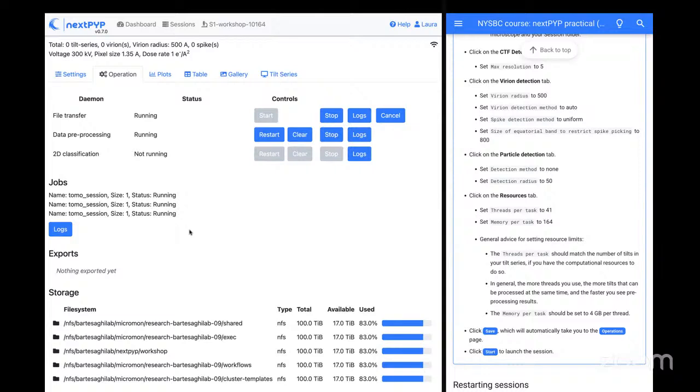So it might be how you're configuring it. Maybe your fiber card is not going at the speed you think it is. We've had issues: technically it should be 10 plus gig out, but sometimes it's a problem at 1 gig. Configuring. But if you're on fiber, then that should not be an issue.